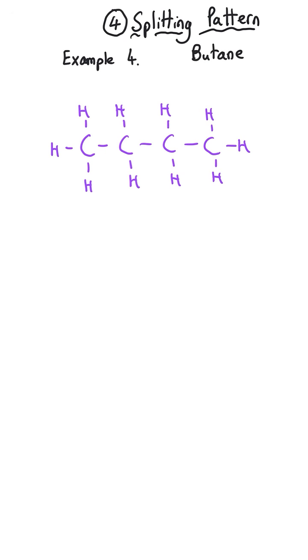The last example that I want to look at the splitting pattern for is butane. Now, since butane is a hydrocarbon, it looks like it should be easy, but there is a misconception that is really common that I want to highlight and help you to avoid.